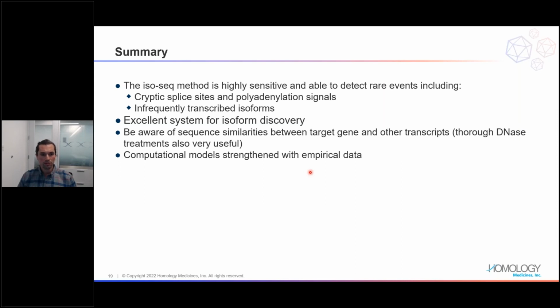Thorough DNase treatments are also very useful to reduce sequencing anything that you don't want to see, and then you can really strengthen your computational models with some of this data.